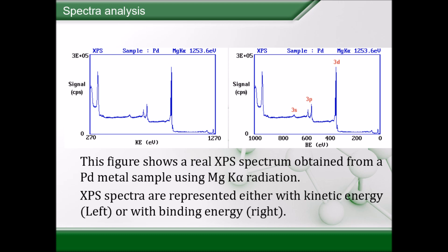So, if you look at the right side of this figure, at the utmost right, the emission from the 4p and the 4s levels gives very weak peaks at about 50 and 90 eV respectively. The next peak is the most intense peak in here, and it is at a binding energy of around 330 eV. This peak is due to emission from the 3d levels of the palladium atom. In addition to that, we recognize the 3p and 3s levels with peaks at around 550 eV and 670 eV respectively.